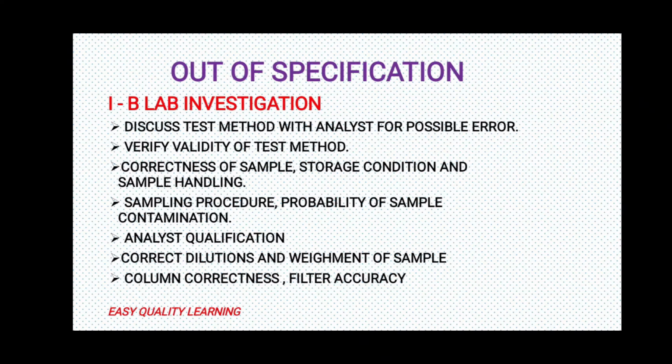Then verify the validity of the test method. We need to check whether the test method is valid or some obsolete version is used. Then correctness of the sample storage condition and sample handling. We need to check whether the sample storage condition and sample handling were correct or not. Then sampling procedure and probability of sample contamination. We need to see whether the sampling procedure employed was valid, whether it was done by a qualified analyst or qualified chemist, or whether there is any chance of sample contamination. That also we need to evaluate.